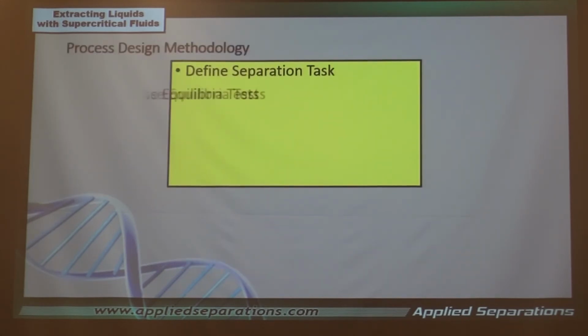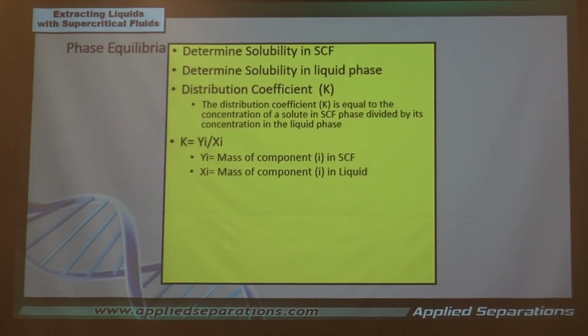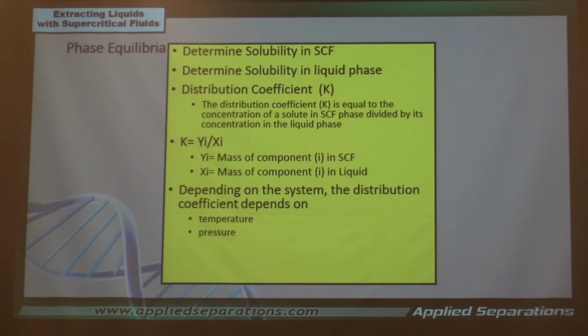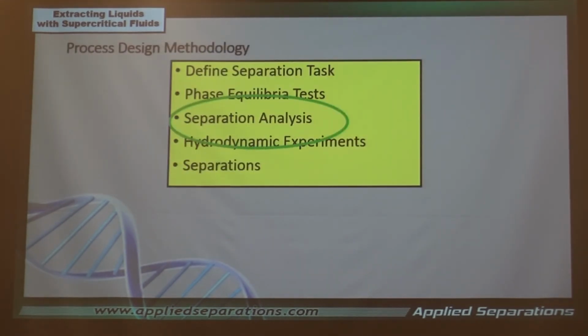Now, like I said, there are all different ways of measuring this and doing these determinations with a variety of different kinds of equations to work out the densities, the separation factors, all of that can be nicely worked out. I'm not going to go over that right now, but this really comes down to conceptually what I just described. We're taking a liquid that is more dense and passing it through the supercritical medium, which is less dense, and then having that solute that is in the liquid pass into the supercritical fluid, okay?